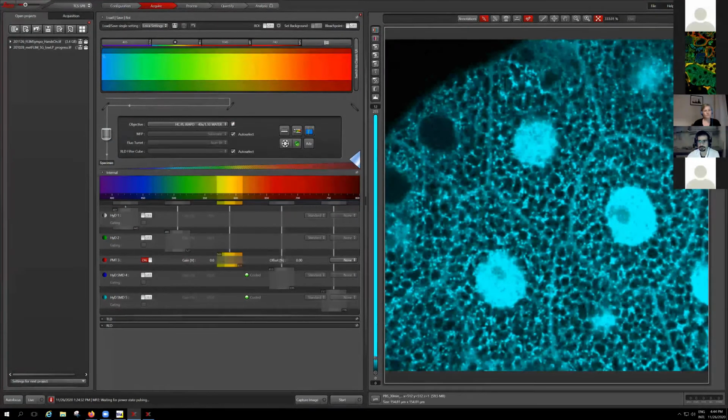In that, we had to test whether fixed cells really change the lifetime. We found out that it changes the lifetime after a week. It again depends on the fixative and the specimen. We used different proteins and different cell lines. All those things tell us that after a week, it is an issue. The lifetime decreases: the fixative quenches the fluorophore molecule.